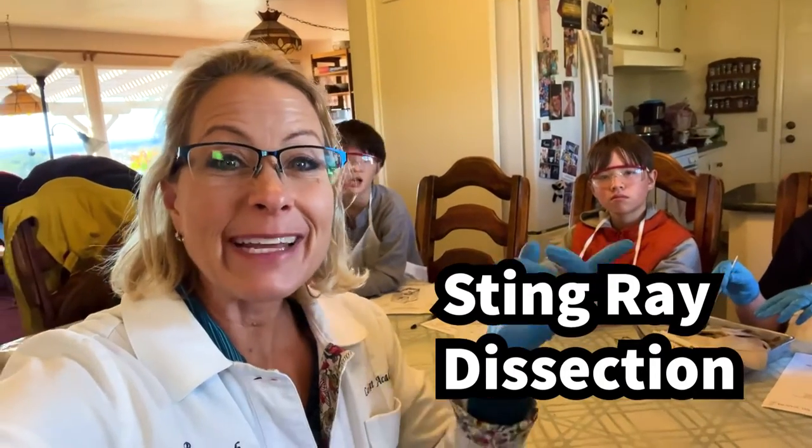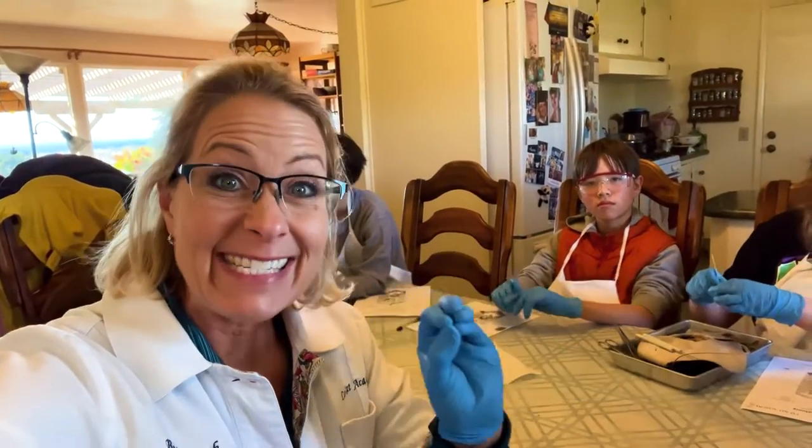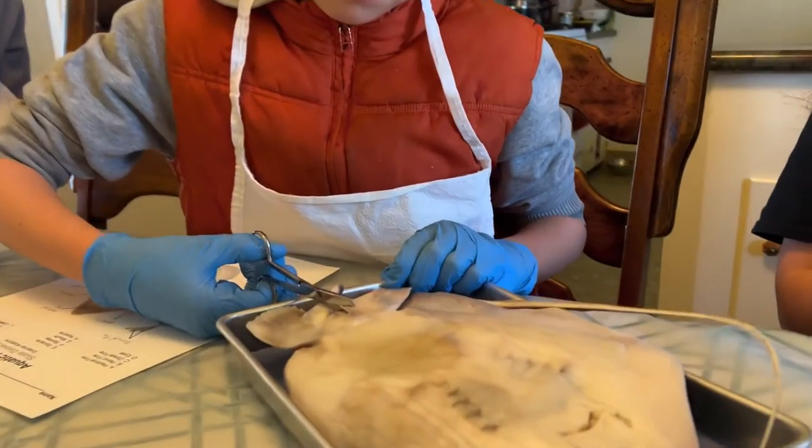Hey Science Lovers, it's Becky with LiveRide Academy and we are doing a stingray dissection. Let's see what these kids are doing.